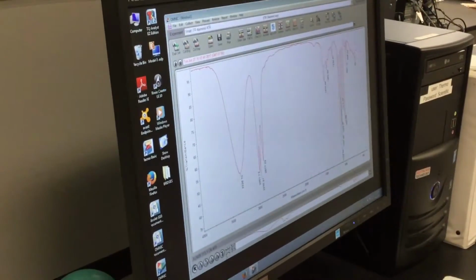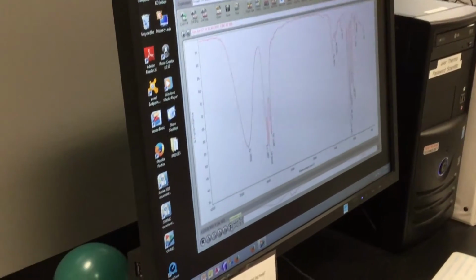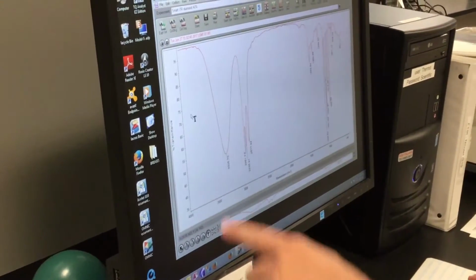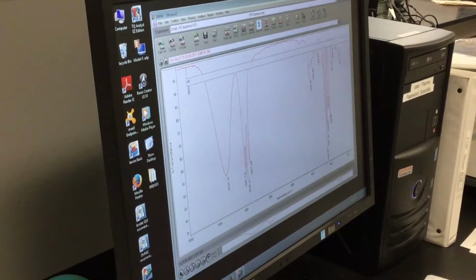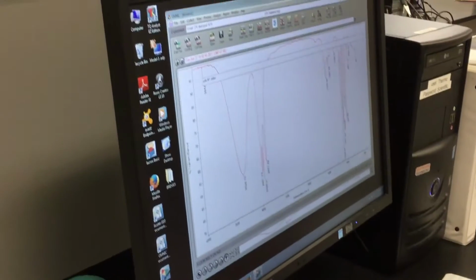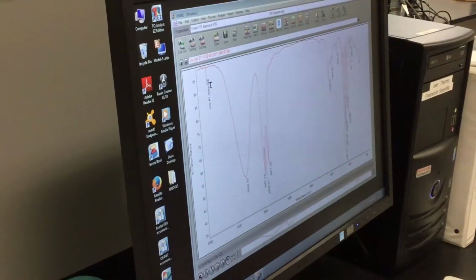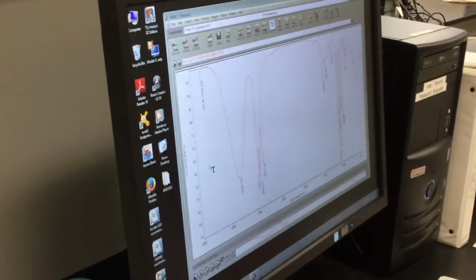Now we can make it look pro by annotating it using this text tool. So there's a little T for text. It says annotation tool. You click on that, now your cursor has a T by it. I can go up here and I can say unknown number 1 or whatever it is, and I can say my name, or whatever you want. You can type tons of stuff. And then it's just about ready to print.